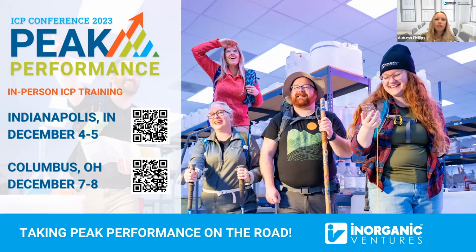So next question, do you have advice for high TDS samples? Well, there is a lot of advice for high TDS samples, and that's actually kind of our specialty. But briefly, first, get the right nebulizer. Second, get the high power and have the argon humidifier in line with the sample. So that would be three typical parameters to look for. And it depends on how high the TDS is, look and adjust the auxiliary flow, like I showed on one of the slides. Generally increase the auxiliary flow up to lifting the plasma off the injector.